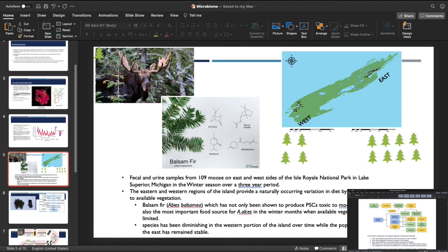And from that table, you can then go on to do testing for diversity analysis. And then you'll also assign taxonomy. So that's the who's there. Taxonomy is kind of tough with the 16S because you're using reference databases, so it's only as good as your reference. And then you can build a phylogenetic tree.